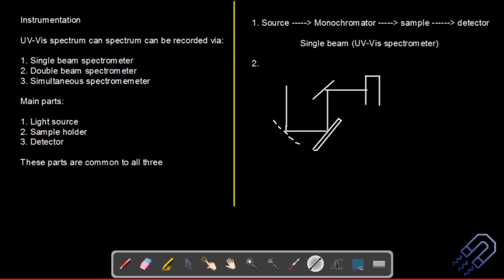This diagram I have probably already given, but that was in the form of an image which I copied from Google. So I would prefer all of you to practice it once and draw it. When you are conducting the exam, if I ask you to draw a schematic of a double beam spectrometer, this is probably something that you need to do.